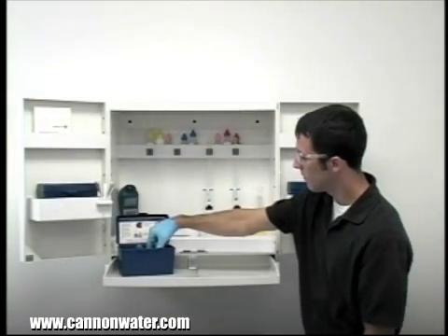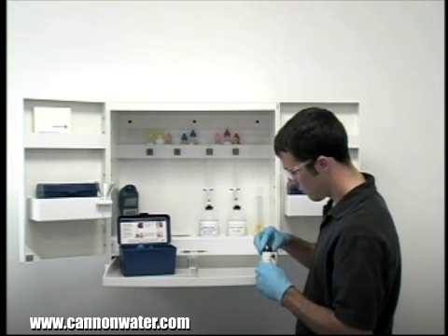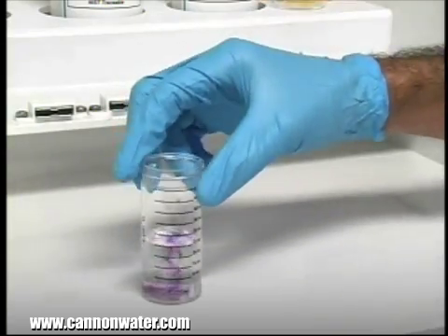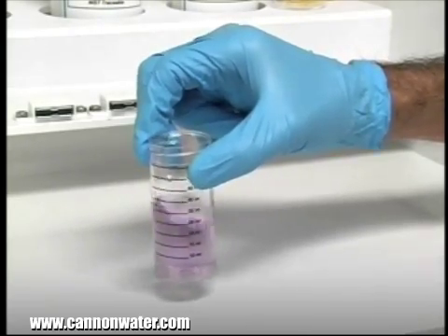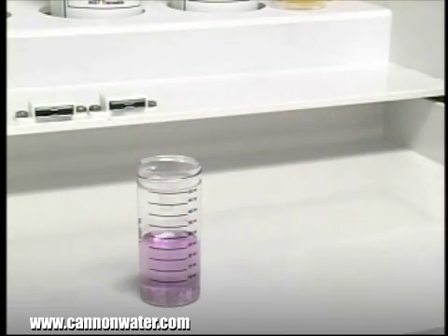The next step according to the endpoint ID procedure is to add one scoop of hardness indicator powder. After the addition of the powder, swirl the vial to ensure the powder is completely dissolved. In this case, the sample has turned red, indicating that hardness is present. If the sample had turned blue, then no hardness is present and the titration is complete.